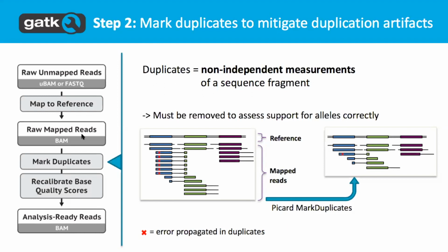It's often different artifacts or the ability to detect some variants in difficult regions that's so influenced. And so we prefer, even if it means that we're going to have an artifact in the data, to have it everywhere, as opposed to having it only in some subsets.